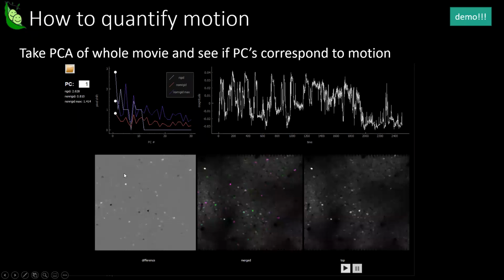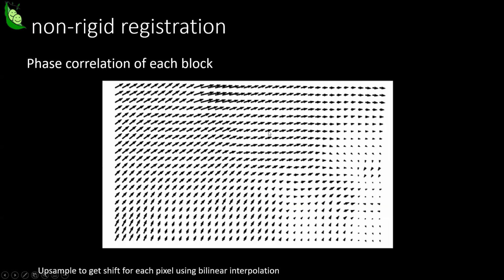And then we can also, so there's ways in suite2p that we can visualize whether or not this registration worked correctly, which I'd like to get into. But first, does anyone have any questions about motion registration? Okay, I see the chat going.